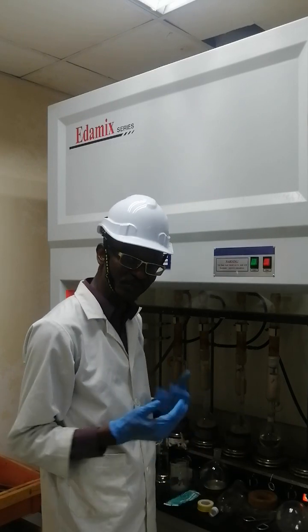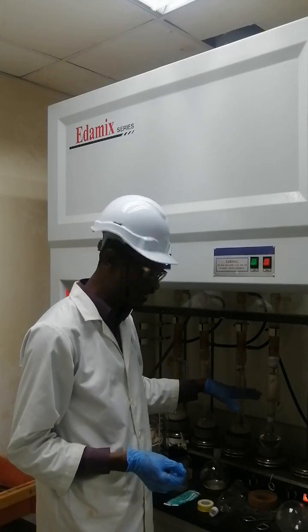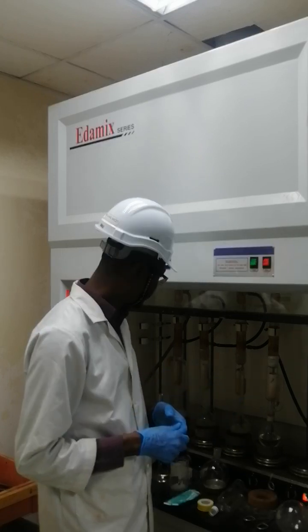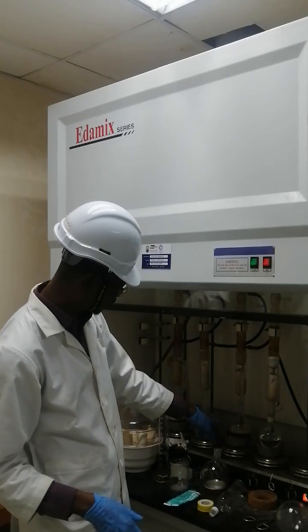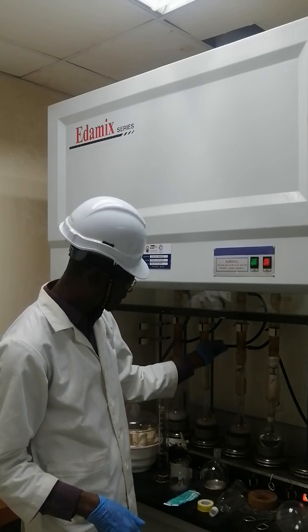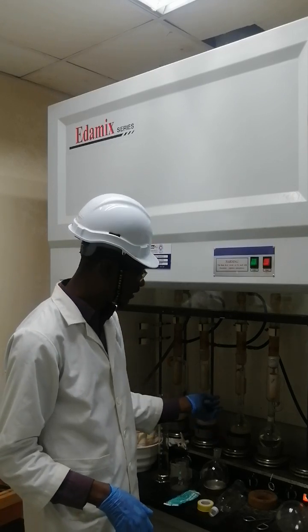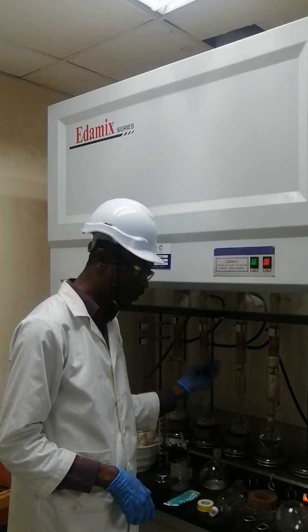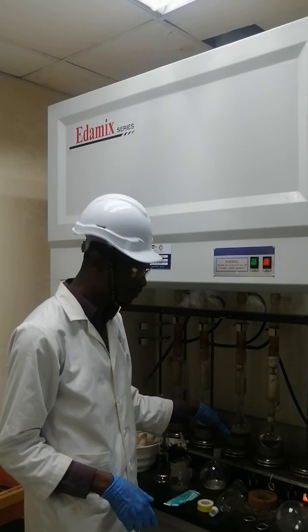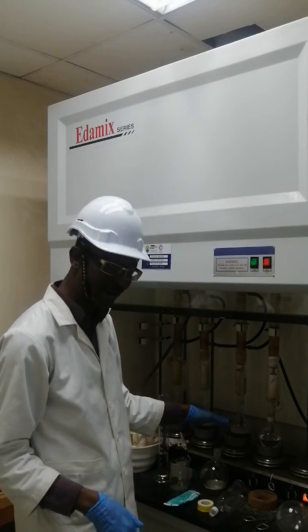So when do you stop extraction? You stop extraction when you see that the liquid in the extraction chamber has become very clear. For example, you can see these ones are ongoing extraction. And you can see because there is extraction, the solvent here has removed part of the solid mixture that is required to be removed, and so it is brownish in color. It's somewhat a dark, amber color.